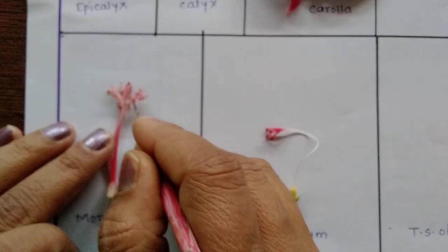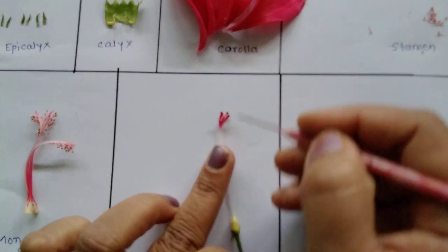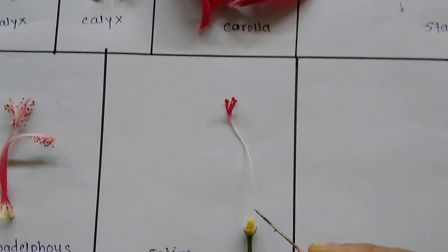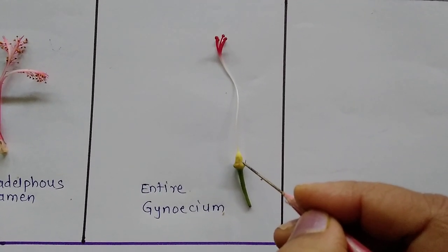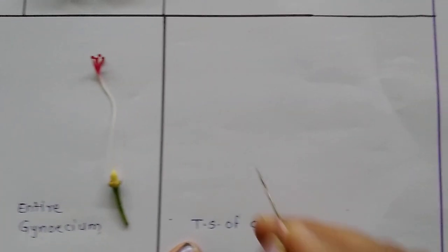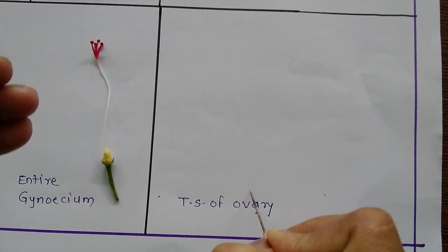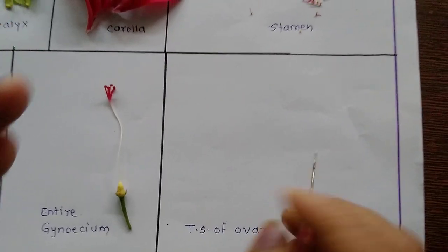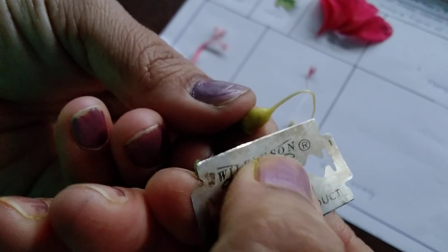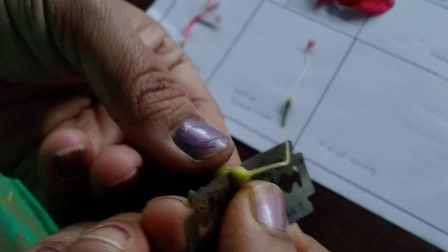This is the monadelphous stamen. After removing it, we get the entire gynoecium. These are the five stigmas. The long tube is called the style, and the bag-like structure at the base is called the ovary. Now we have to take a transverse section of this ovary, show it to the examiner, and draw the figure in your answer sheet for one mark. So take a transverse section of the ovary very gently.